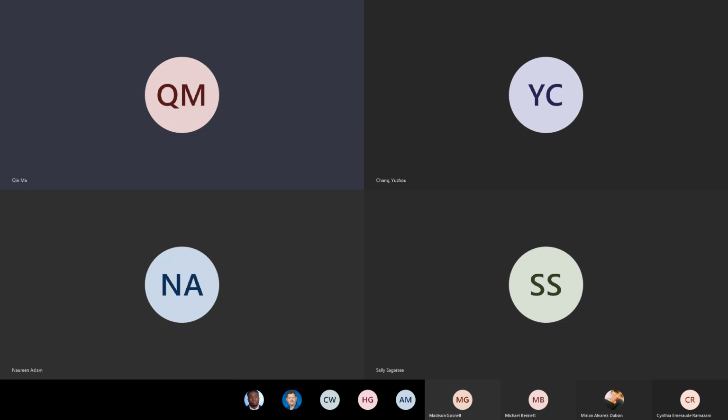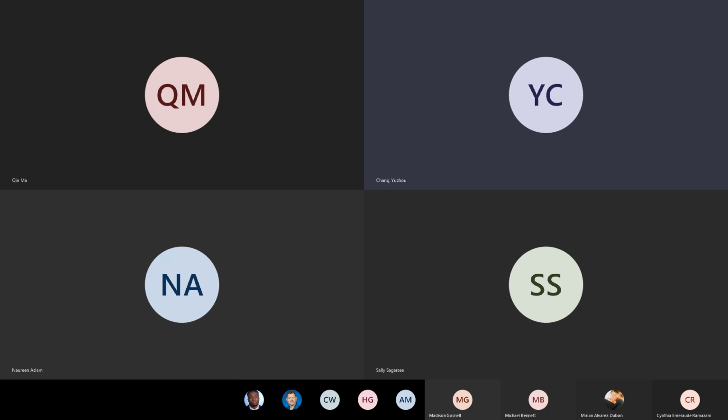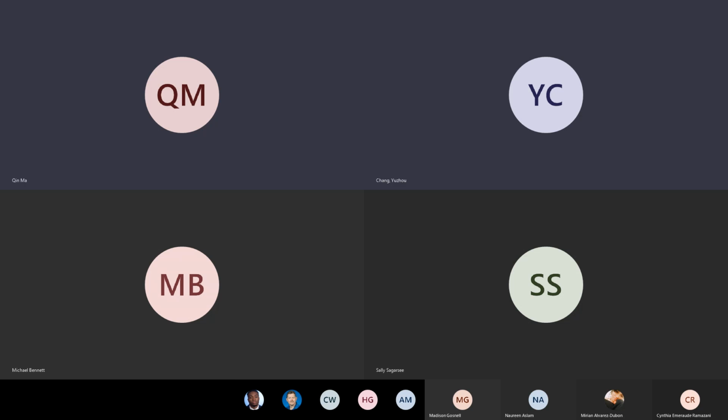Okay, maybe I can ask a question. So has anyone successfully generated the results based on Yuzhou's code? No? Everything in the 10x file worked when I was doing it. I just couldn't get the H5. Okay, appreciate it. If you want to practice more on different H5, you can log into the 10x Genomics official website, and there are a bunch of data. You can download them.